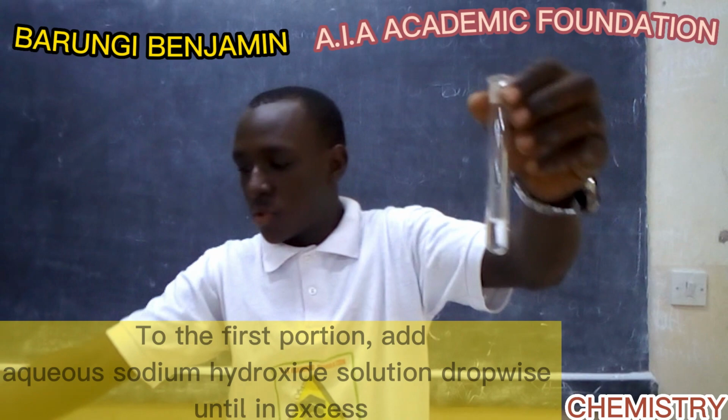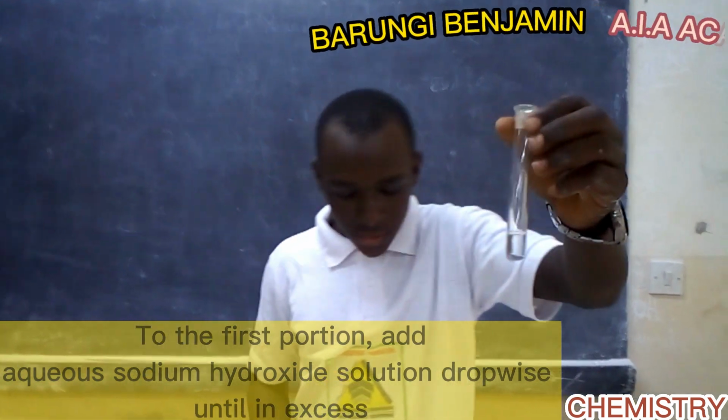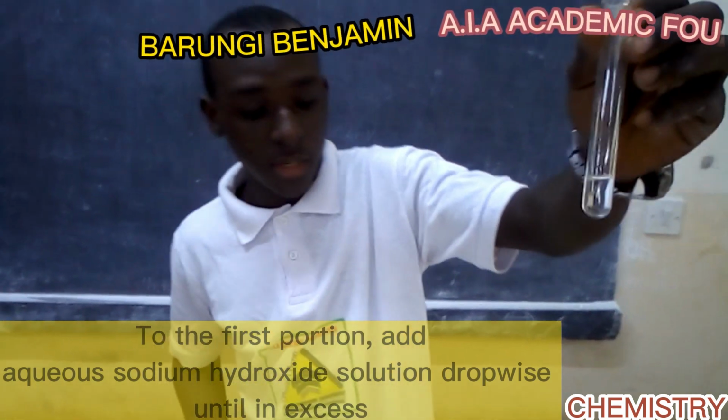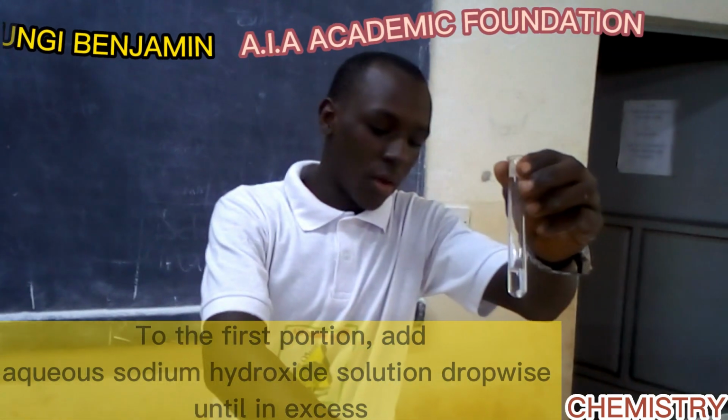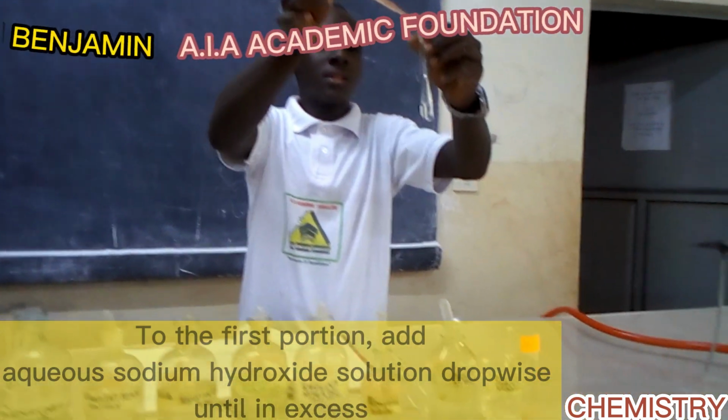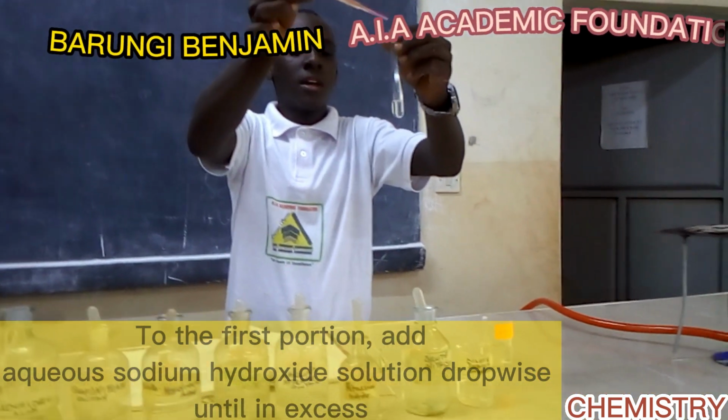This is our first portion, and they have told us to add sodium hydroxide dropwise until in excess. So this is our sodium hydroxide, and we are going to drop until in excess like they have told us.